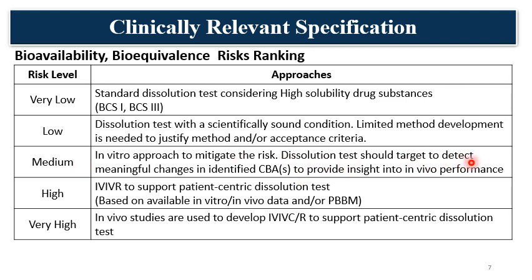Dissolution test should be targeted to detect the meaningful changes in the identified CBAs and to provide insight into in vivo performance. So from here the clinically relevant specification starts. Here all the CBAs are required to be identified and controlled with the specific discriminatory and clinically relevant dissolution specification.